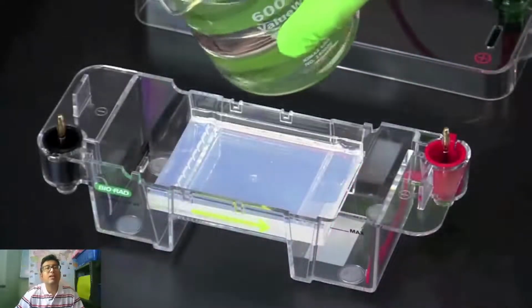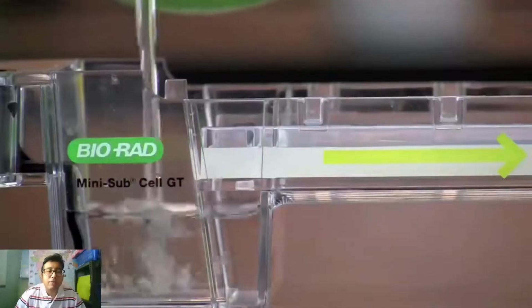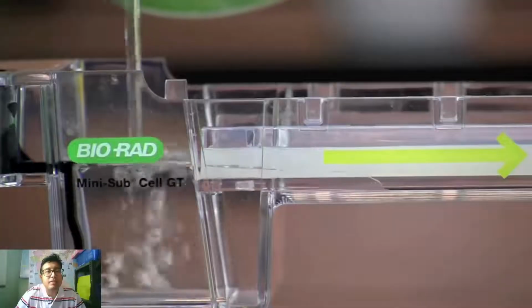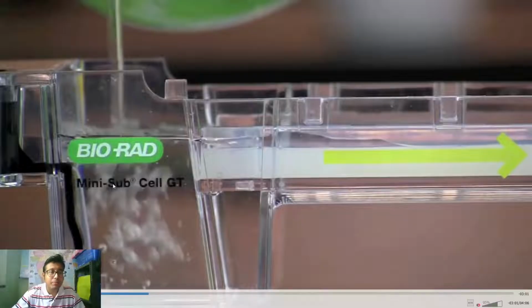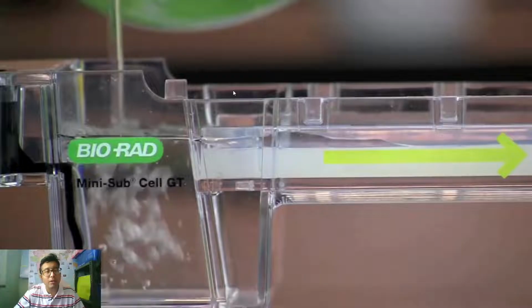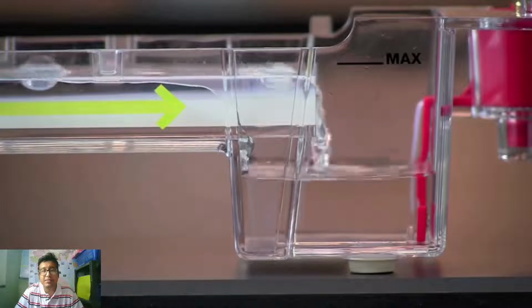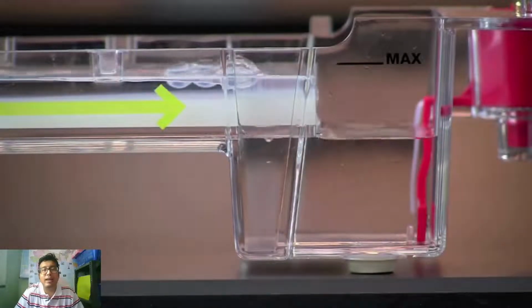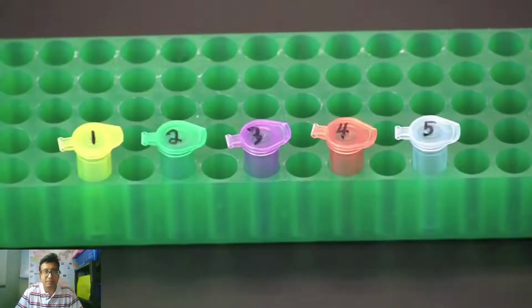So, now you see we are filling the tank with the buffer. Watch closely, the buffer is filled in such a way so that it covers the entire gel. If it is not covering, suppose the buffer remains till here, then we need to connect it with the help of a moist filter paper. One end will be here and another end will be connected to the buffer. But we are choosing to fill the whole electrophoresis tank with the buffer. See, we are filling the whole tank, keeping in mind that both sides and the gel are completely submerged, okay.